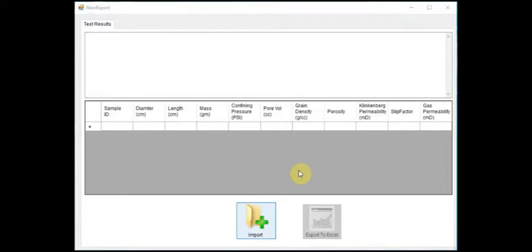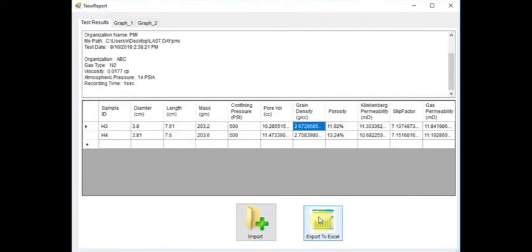We can also see the confining pressure, pore volume, grain density, porosity, Klinkenberg permeability, slip factor, and gas permeability. Below this table is an import function that allows us to import a data file from a previous auto test. This will populate the table and then reveal the option to export the data to an Excel spreadsheet.